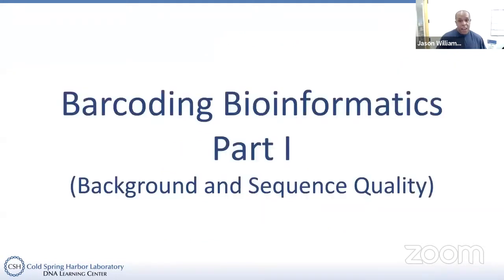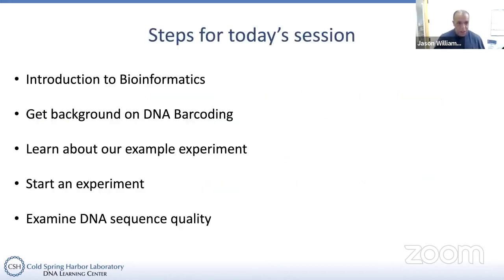Okay, so here is the first subject that we need to talk about. Barcoding bioinformatics, this part 1. We're going to talk a little bit about background, both what is bioinformatics, this term that I've used several times now, and what is DNA sequencing, because we need to understand how we get DNA sequence, what that is, and what the relationship is with DNA barcoding and bioinformatics. That'll lead us into the actual exercises that we have planned, and we'll have some questions for you to answer as we get further along.